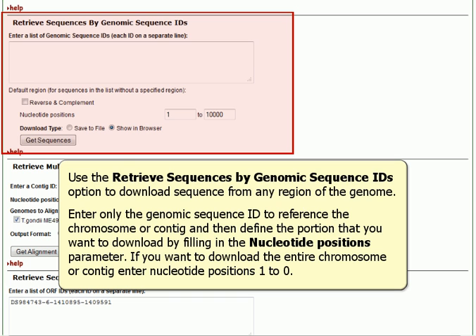Use the Retrieve Sequences by Genomic Sequence ID option to download sequence for any region of the genome. Enter only the Genomic Sequence ID to reference the chromosome or contig, and then define the portion that you want to download by filling in the nucleotide positions parameter. If you want to download the entire chromosome or contig, enter nucleotide positions 1 to 0.